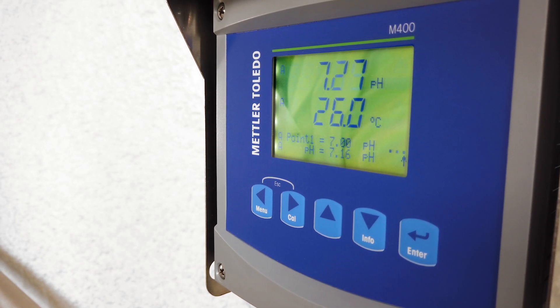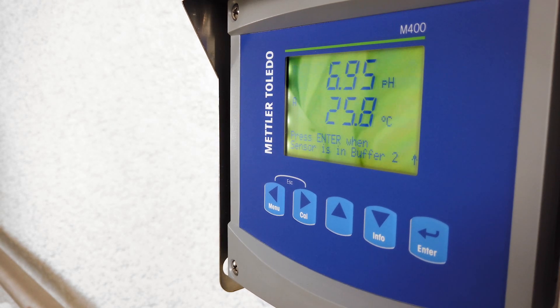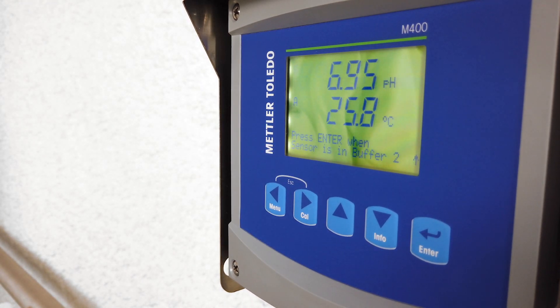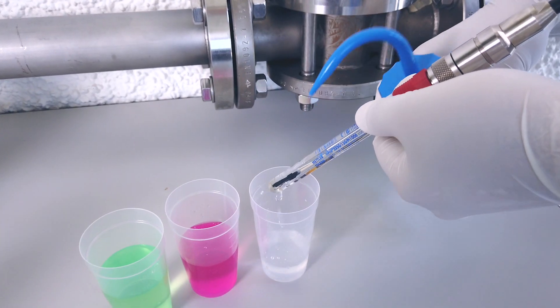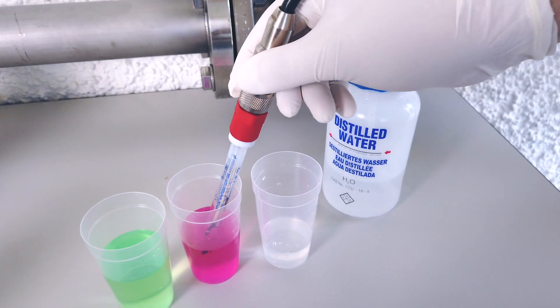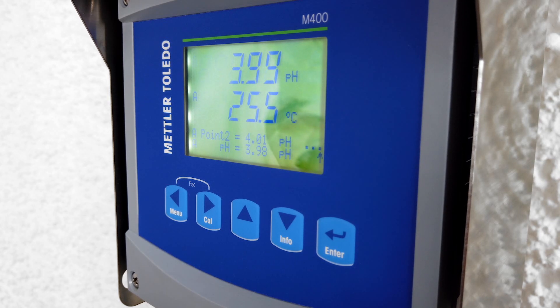Now the transmitter instructs you to put the sensor into the second buffer — in this case it's pH 4. Remove the sensor from the first buffer, rinse it again with distilled water, pat it dry, and place it into the second buffer. Press the enter button to do the calibration.